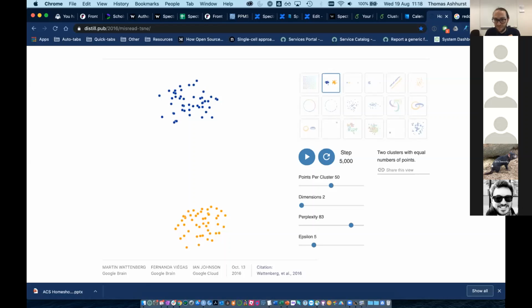Oh yeah, so there's a good question here about which clustering method do you pick for a discovery type approach. So FlowSOM doesn't actually require you to necessarily specify the clusters. You have to specify the grid size, so like the level 1 clusters. You don't have to specify metaclusters, which is the groupings of the clusters. You can let FlowSOM decide that for you. So it'll tell you, okay, I've found 15 groups of cells that I think are meaningful. We don't typically like doing that because I guess I'm the one who ends up deciding if it's a meaningful population.